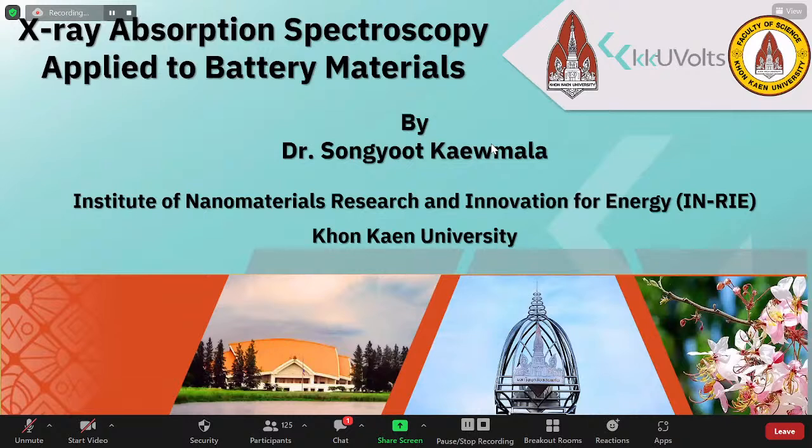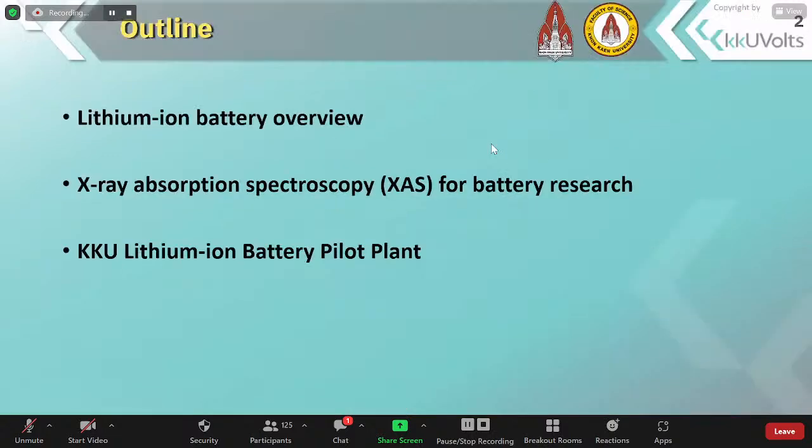I am a representative from the Lithium-Ion Battery Research Group from Khon Kaen University. Today, I am going to talk about X-ray absorption spectroscopy applied to battery materials. The topics of my presentation consist of three main parts, including the overview of lithium-ion batteries. I will talk about the main components and working principle of lithium-ion batteries.